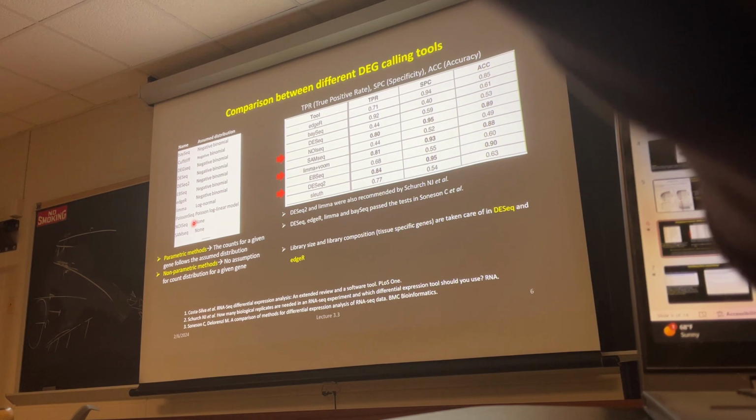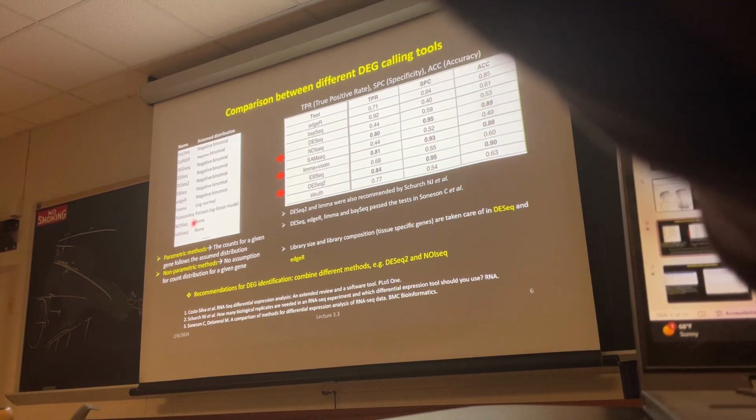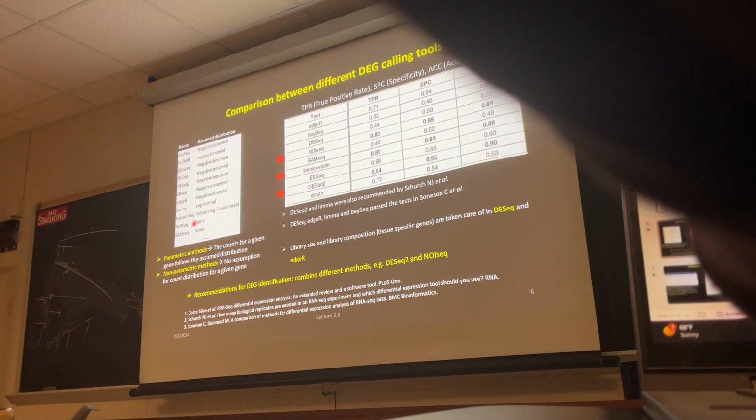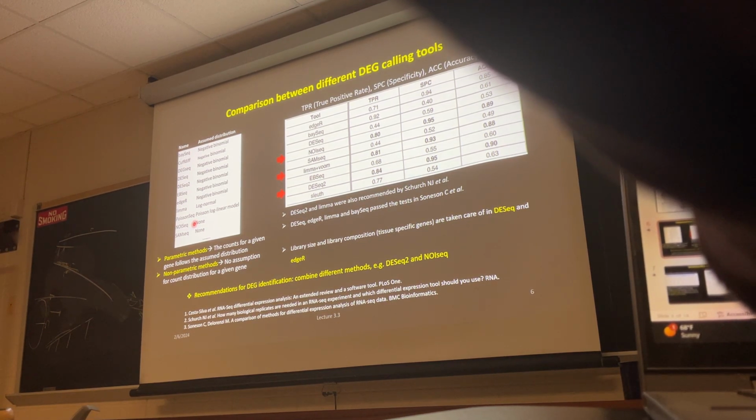Basically you're trying to validate from two independent statistical approaches. That's why it's always better to use more than one tool, like use DESeq2 of course, and then use NOISeq. Since those two assume totally different types of distribution, one assumes a distribution, one never assumes there is a distribution in the data set, you get the conserved set of differentially expressed genes.